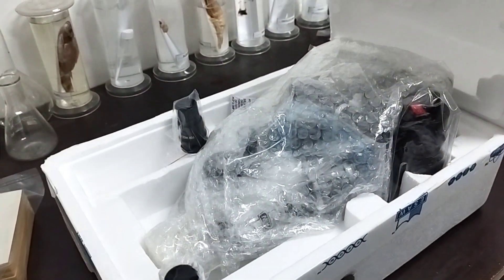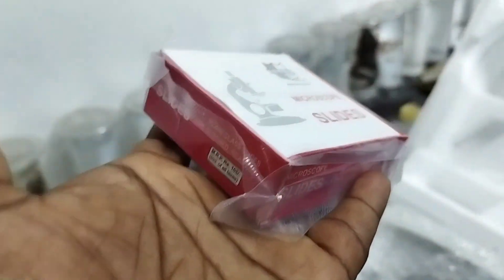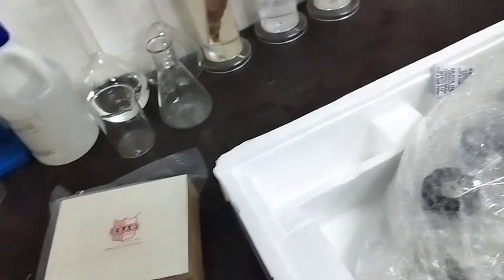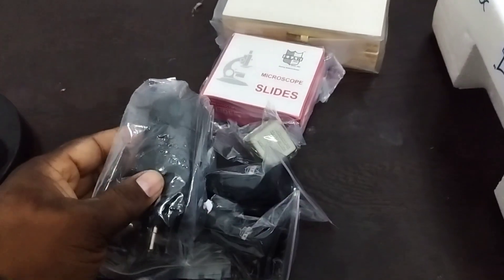Okay, surprise inside! They have provided some microscopic slides and some cover slips. This is an eyepiece lens — 10x — and they have provided extra cushion on it. There is also another eyepiece lens at 25x. And this is an artificial light source — so many accessories they have provided. Let's open the main microscope.